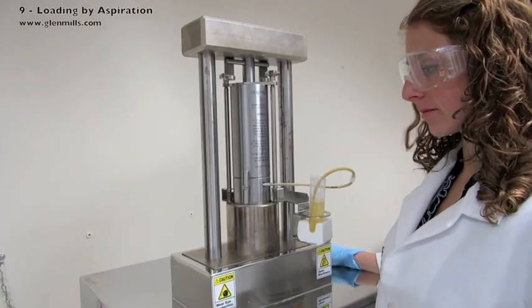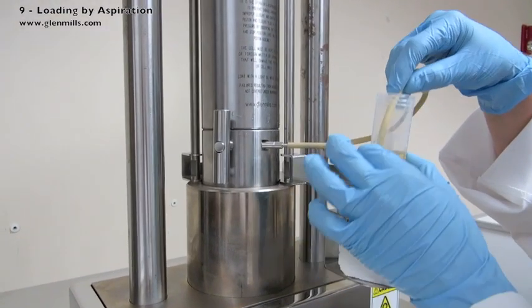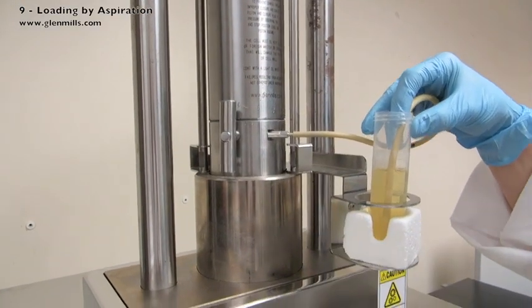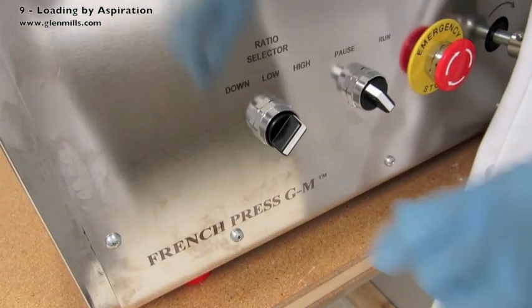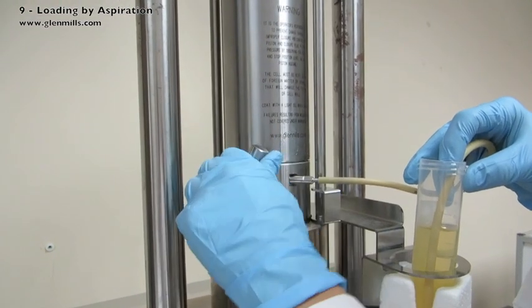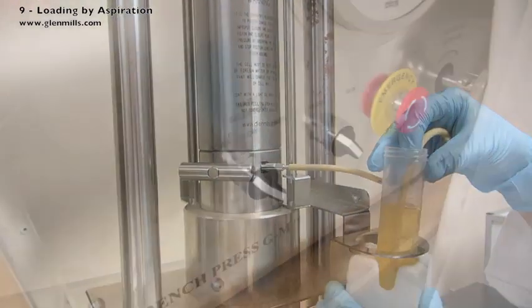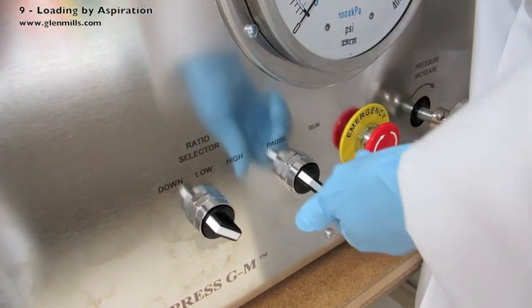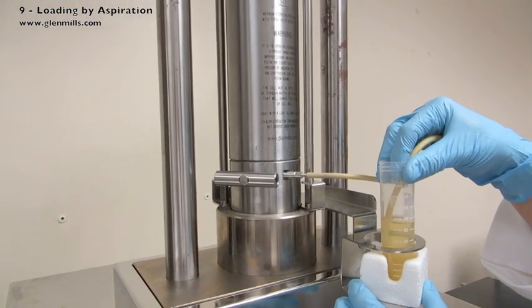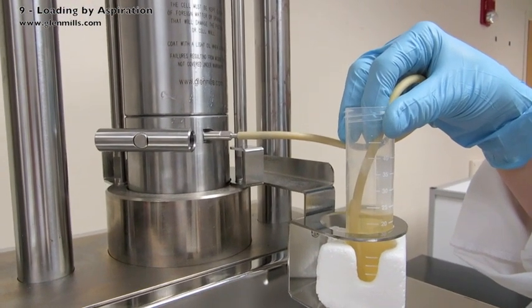Cells can be loaded into the standard pressure cell by putting the flexible tubing into a beaker or a tube, turning the machine's ratio selector to down, and opening the valve several turns. Turn the machine to run and the cells are aspirated into the standard pressure cell.